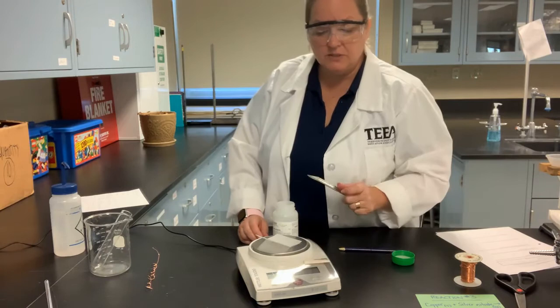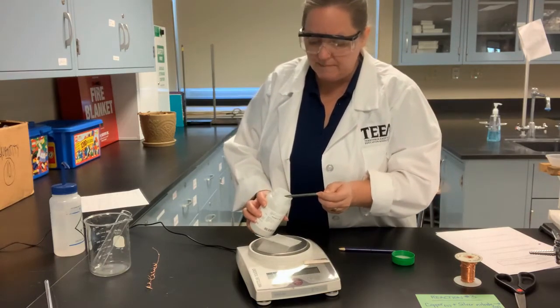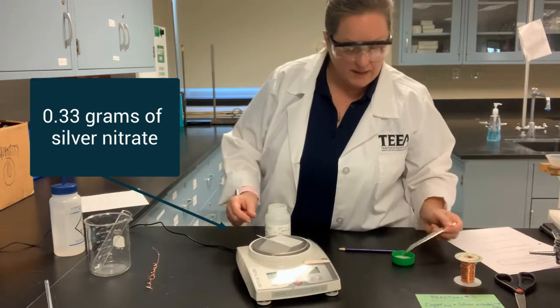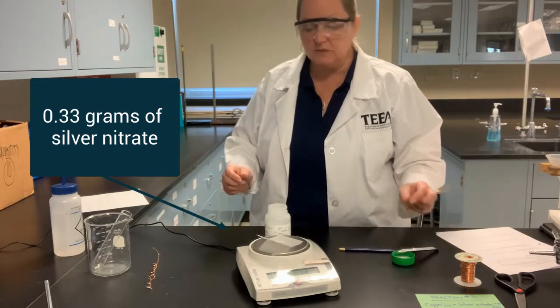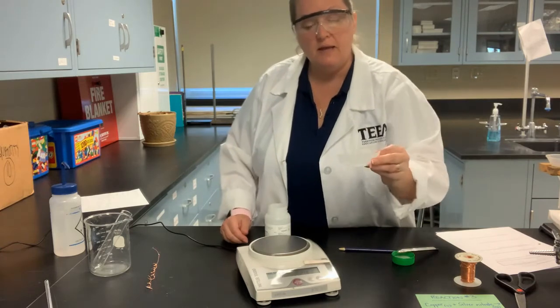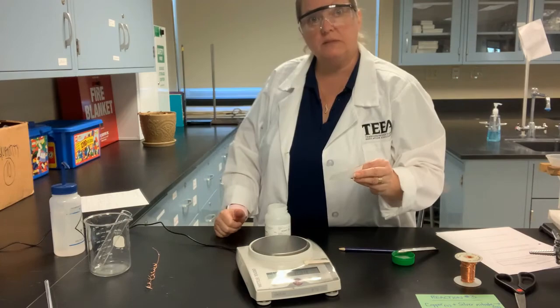So the next thing I'm going to do is zero out the balance. And I'm going to measure out about between 0.1 and 0.2 grams. And we're at 0.33, and we're going to go ahead and go with that at 0.33 grams. It's pretty tough to adjust it with such a close amount. And I'll also insert some pictures of both of the reactants so you'll be able to see those up close.